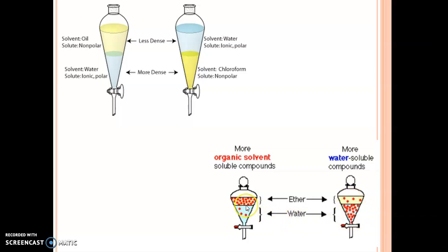So two immiscible liquids, that is ether and water, are used. If there is an organic solvent, it is used to separate out the organic compounds, and water is used to separate out the water-soluble compounds.